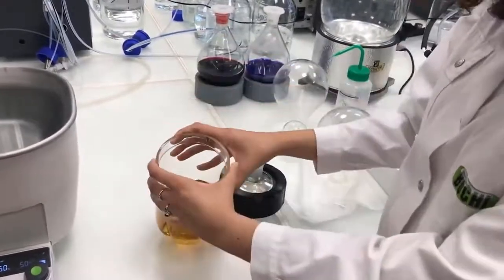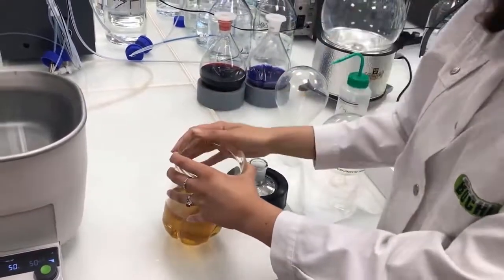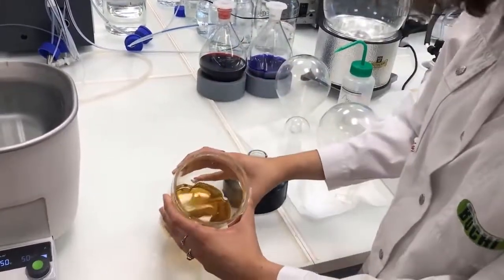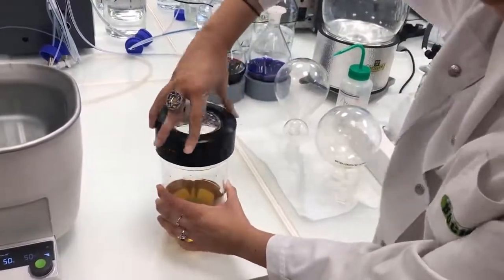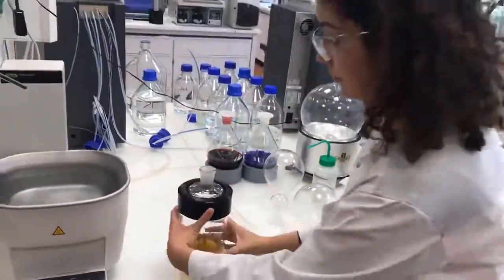You will have your sample here, so your food like your, I don't know, oranges or whatever, and if you want to get back your sample, then you can access it much easier than in a normal flask. So how does it work? Quite easily, you just close the system, and that's tight.